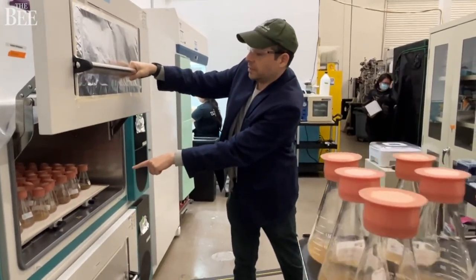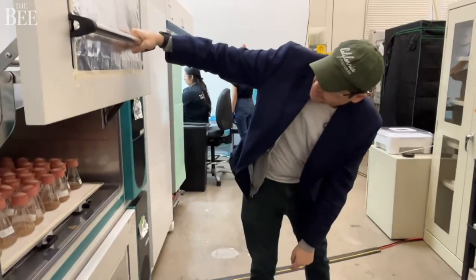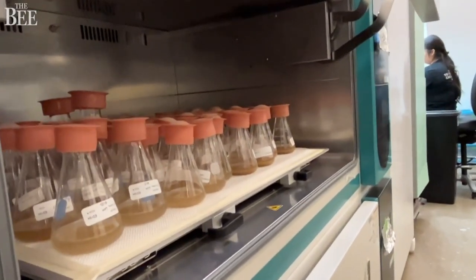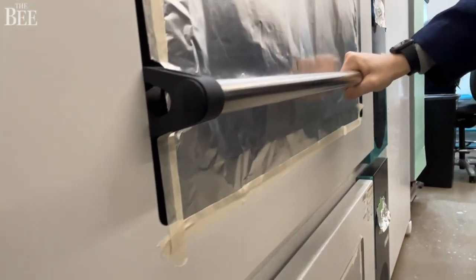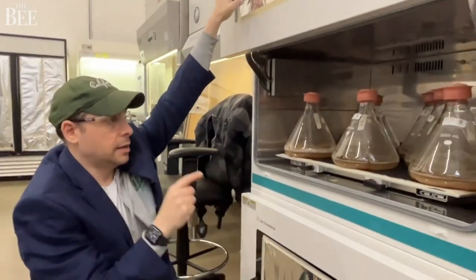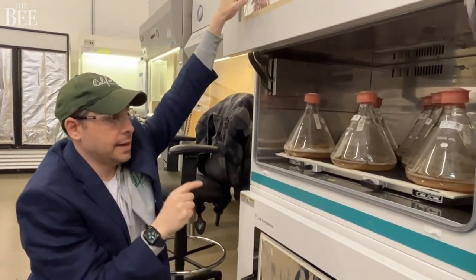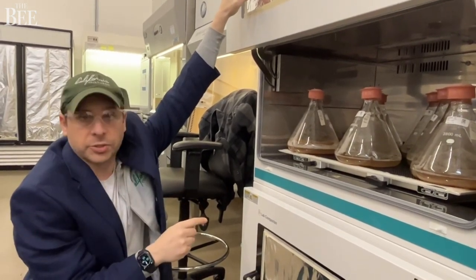This is basically where they sleep at night and exercise and grow. From there, the best cells and those that we're most excited about eventually go over here — these are our cell cultured cocoa cells that are getting ready to go to their final stage of production.